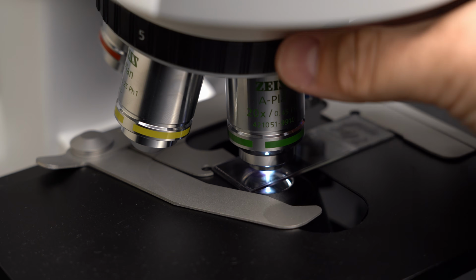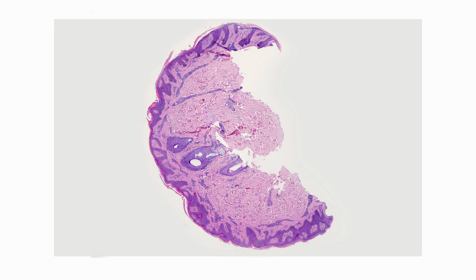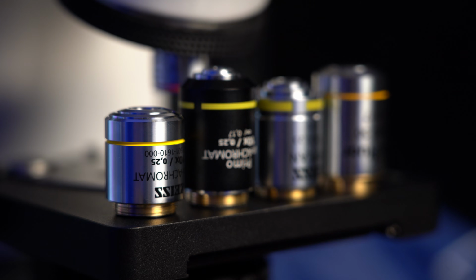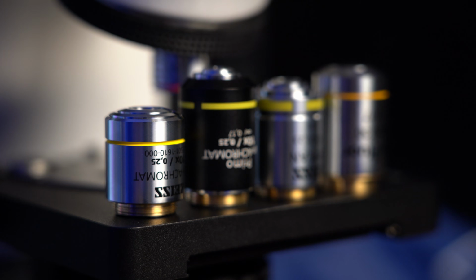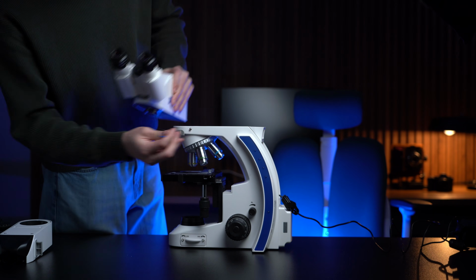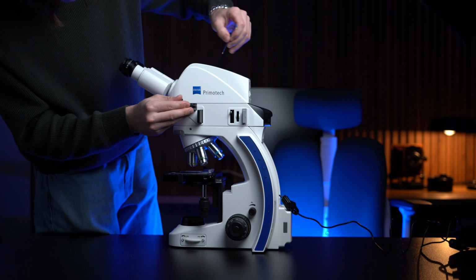The cheapest microscopes use finite optics, usually 160 mm. The objective is the most important part of your microscope in creating a high-quality image. With infinity optics you can upgrade later. Olympus objectives, some Zeiss objectives and many others are compatible or can be adapted. You can also add accessories like reflected illuminator for opaque samples or polarization modules to study crystal growth in liquid. For some of them, you can use simple DIY things.